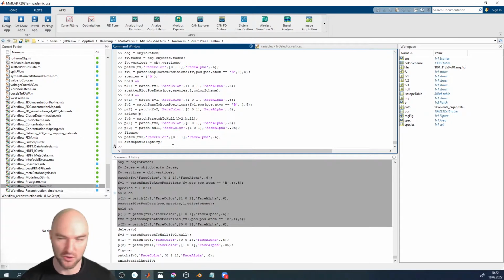And so how do we apply that? Well, we now create our patch FV4 is patch centroidal Voronoi tessellation. Lloyd's algorithm and centroidal Voronoi tessellation are the same. And in this case, our original mesh is FV3.